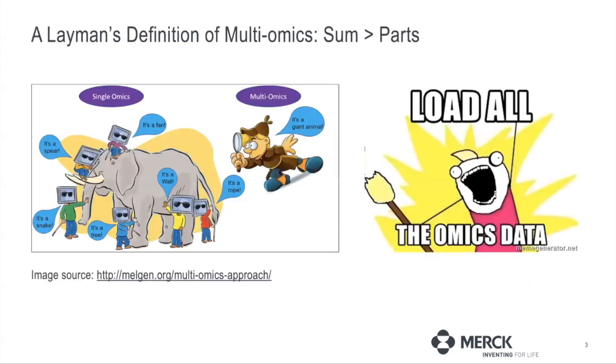At the very beginning, I should clarify that I'm going to use the term multi-omics a lot. Again, multi-omics has different meanings. In general, usually integrated omics, which is shown in this figure, means that from a single omics you get one set of interpretation of your data. But when you have multiple omics, you usually get a more comprehensive viewpoint of the biological phenomena that you are interested in investigating.